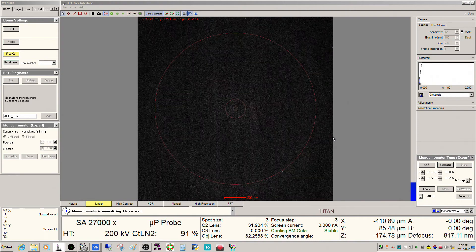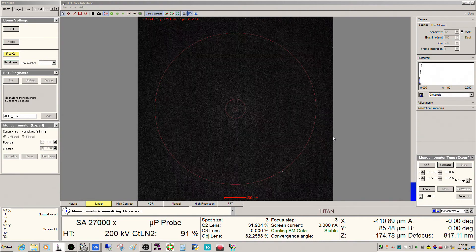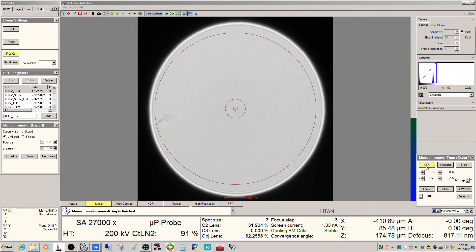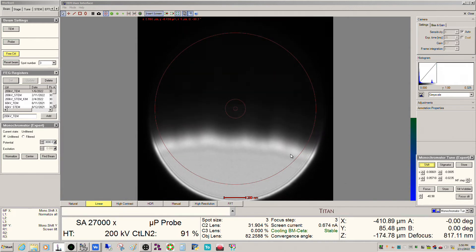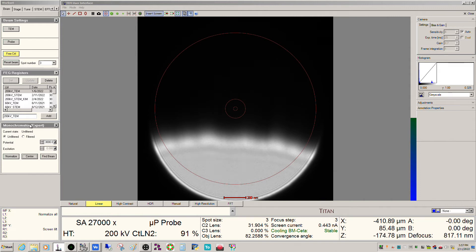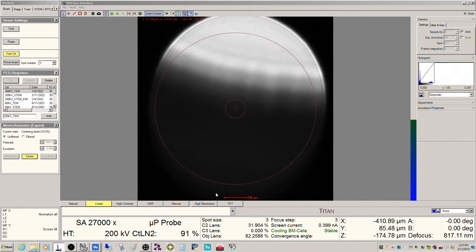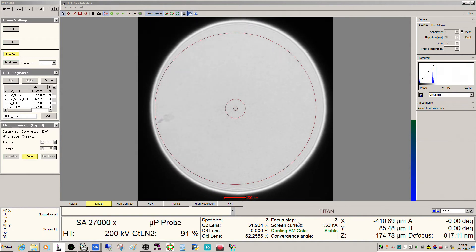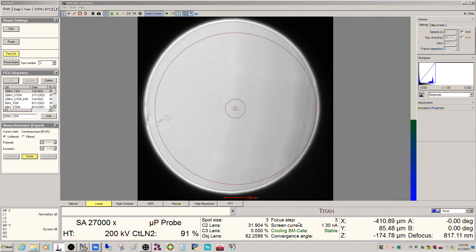All right, it should be getting close. There we go — this is actually not too bad off. What's more typical though is to see something where part of the beam is cut off. So if this happens, if you don't want to do this manually, find the regular monochromator panel and click center. What will happen is the system will do an automatic adjustment of the shifts to try and maximize the beam current, and it uses that as its criterion for centering of the monochromator.